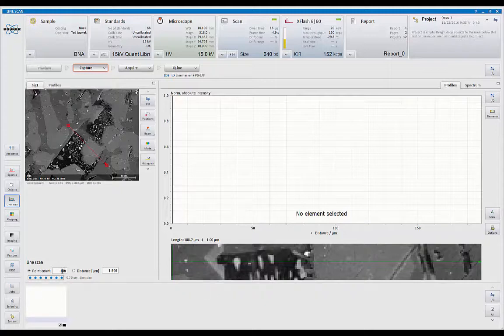Now, down here I can specify the number of sampling points. Remember, we'll be collecting a spectrum at each one of these points. Or I can specify the X-ray spatial distance I want. I know for this sample my X-ray spatial range is about 1.2 microns. So by selecting that, the system tells me I'll need 158 pixels to sample point to point to point. Well, I'm going to round that off a little bit, so I'm going to go up to 160.